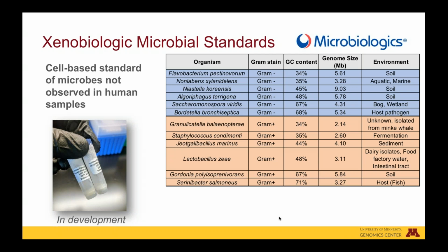And so, given all this, we decided to use PacBio sequencing to obtain our reference genomes. And in addition to the practical purposes, as a service provider, we were excited to use the diversity of these microbes as a sort of test bed for this new microbial multiplexing protocol, or what was then a newer protocol. And so PacBio provided some library prep and sequencing reagents to us for this study as part of a co-marketing partnership.